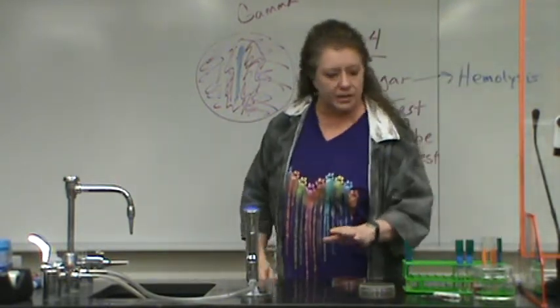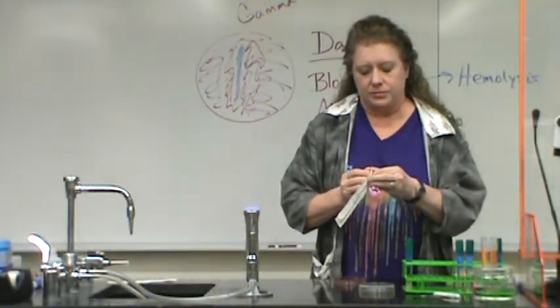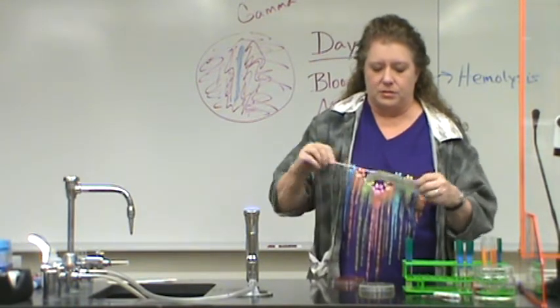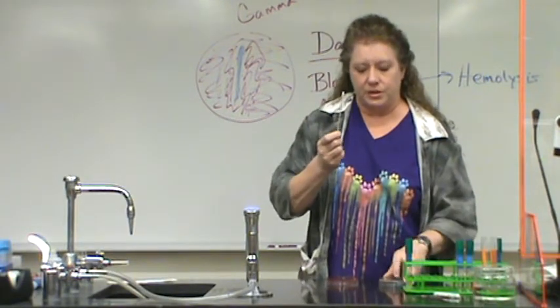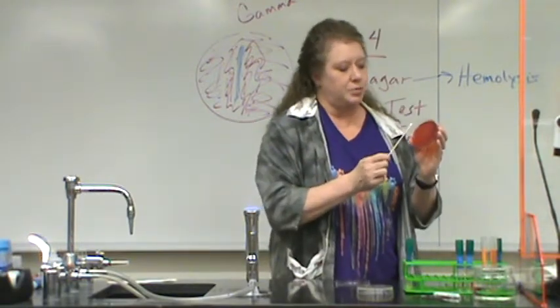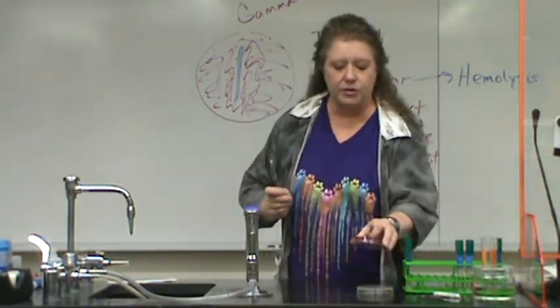All right, so to inoculate this blood agar plate, you need a sterile swab. Okay, and so we peel our swab down, pull it out by the handle, and then we'll take our TSA plate of isolate number 1, with some culture on it. You want to be able to see the culture on it because you want some heavy growth. And then you're going to pick up your blood agar plate and just go back and forth a few times down the middle, just in that streak as on the board. Okay, so you just have a nice line of heavy growth.